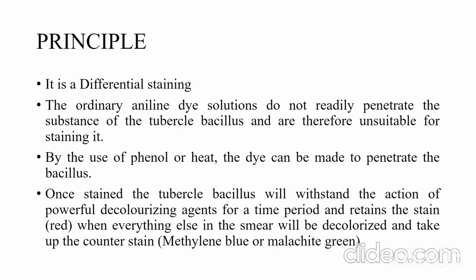We allow the organism to take up the stain by providing heat or by giving phenol. By using decolorizers like 20% sulfuric acid or 3% hydrochloric acid, we are decolorizing the smear, but the acid-fast organism alone retains the stain at that percentage for a particular time period. So when we use a counter stain, the background takes up the blue counter stain, whereas the acid-fast bacilli still remain pink.